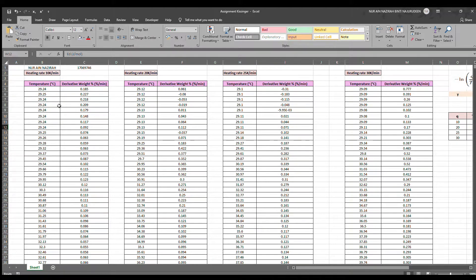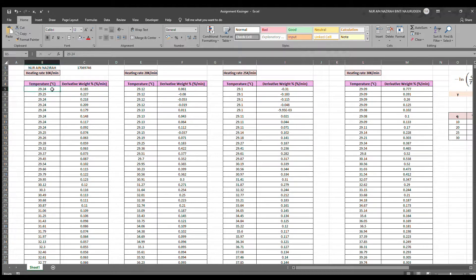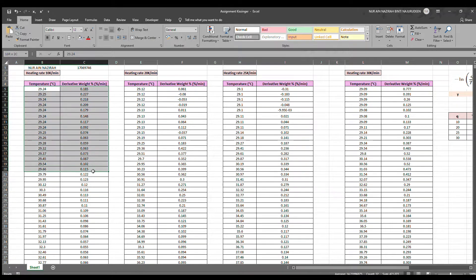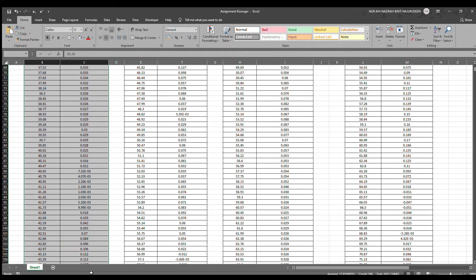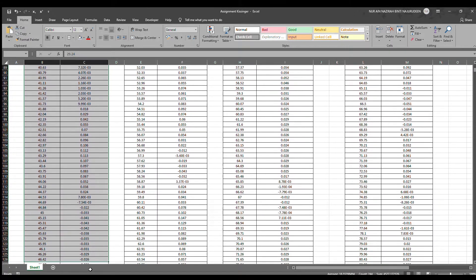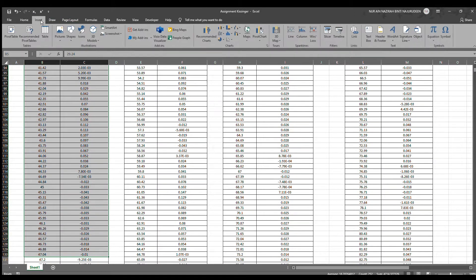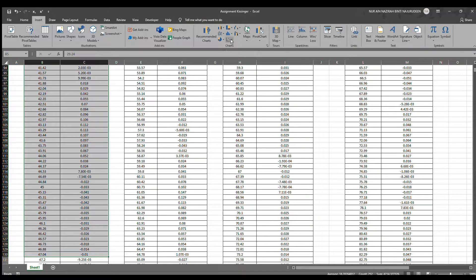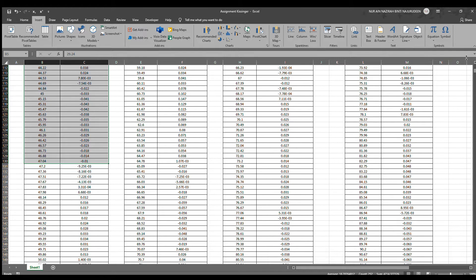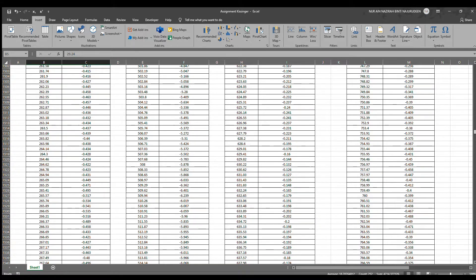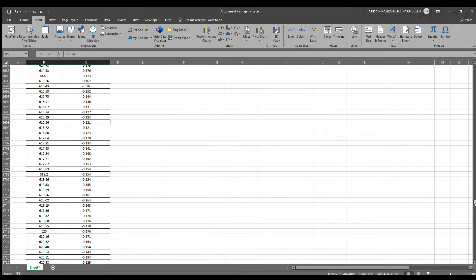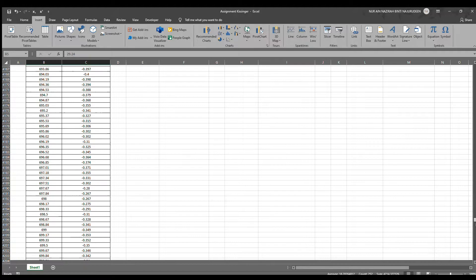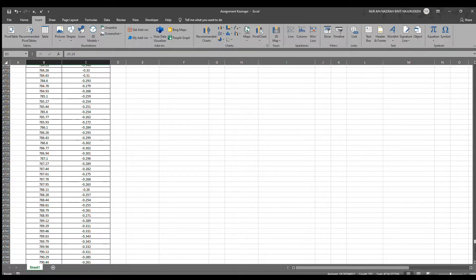What we have to do is, we have to highlight this data in which the x-axis is the temperature and the y-axis is the derivative weight percentage. We go to Insert and make a chart graph and then we will be left with a graph.